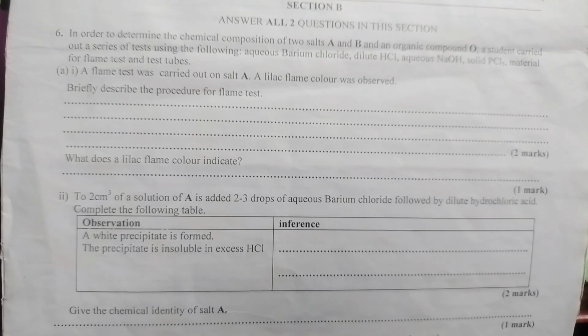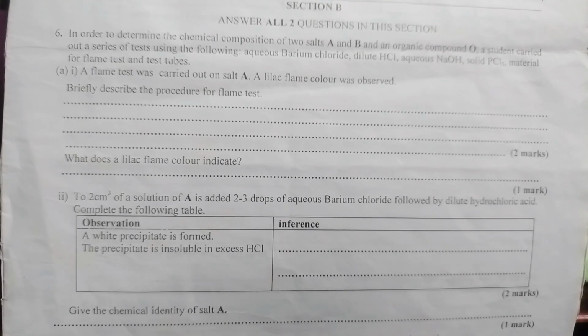Note that when you use silver nitrate as the test reagent, what should come to your mind is the halide ion. Further tests will tell you which one precisely is present. When you see acidified barium chloride, what should come to your mind is the presence of the sulfate and the sulfite ion. Both produce white precipitate. Further information will tell you which ion is present. Insoluble in acid will give the sulfate, and production of sulfur dioxide will give you the sulfite.